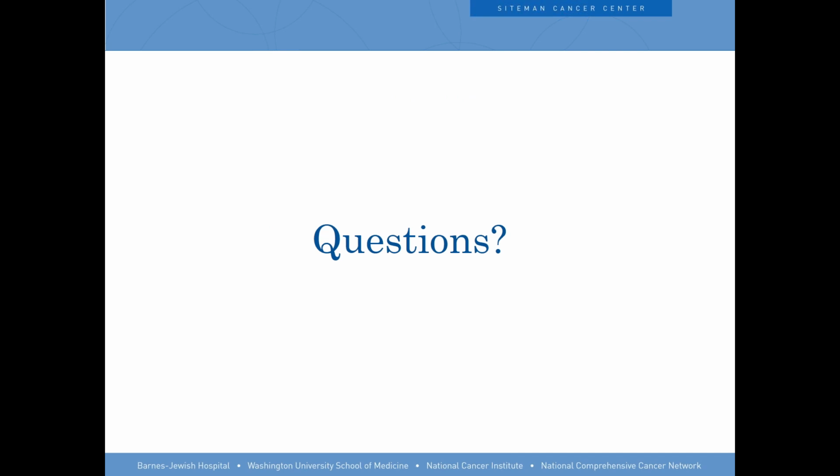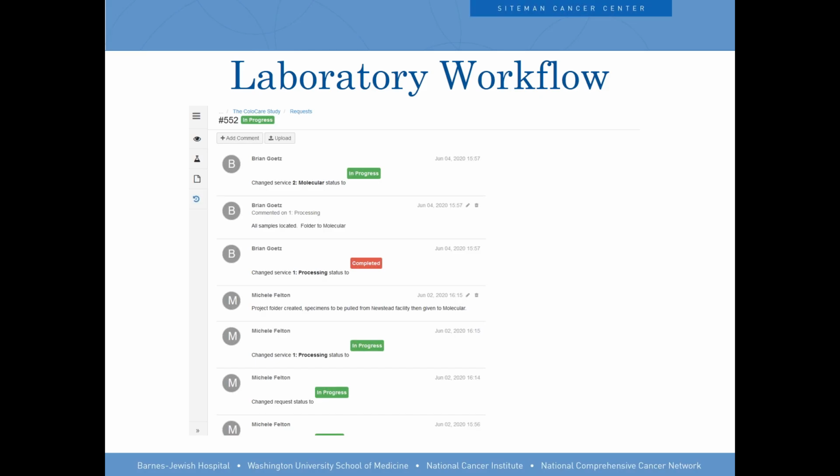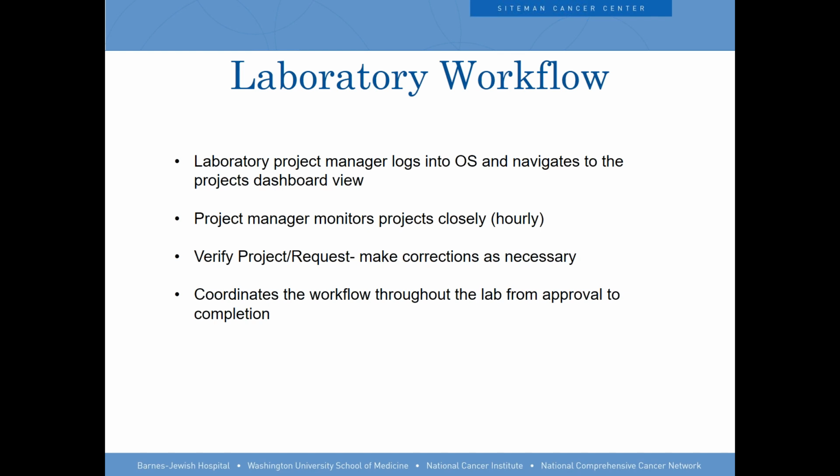Yeah, thanks for clarifying that. Right, so let us take up a couple of questions that have come up in the chat. And I think you showed this, Dave, in one of these slides. The question came up actually before that slide, but just to clarify: can I find all the specimens that were released in a particular request? You showed that slide where you had the list of specimens in a project. And what other reporting do you do other than, there's a download button here, I suppose, to download the report? I'll let you answer that.